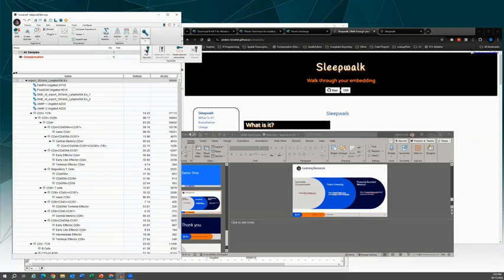So you'll create keywords that will identify those different controls and treatments, and then include those when you do the concatenation step.